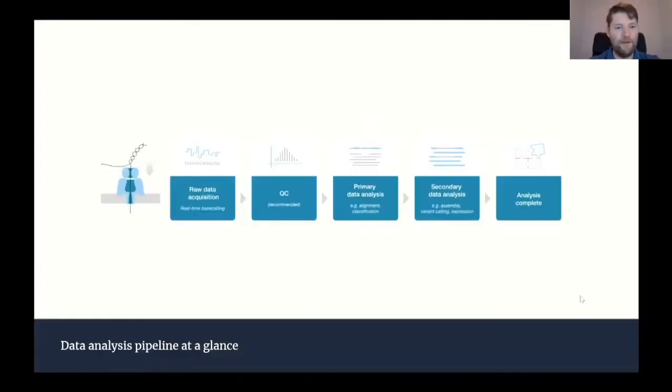So the beginning here, of course, is what we talked about. The DNA goes through the pore and we get out this squiggle, this signal, the raw data acquisition, as it were. And then immediately the next step is to try to interpret that signal and produce the A's, C's, T's, and G's, the bases from that. And if we do that naively, then we'll end up with a short fragment of these letters for each squiggle.